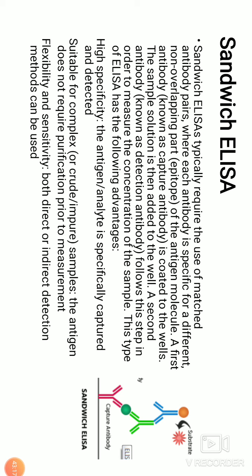Now, sandwich ELISA: antigen can be detected or measured by sandwich ELISA. In this technique, unlike the previous one where antigen was coated, here the antibodies are immobilized on microtiter wells. A sample containing an unknown amount of antigen is allowed to react with the immobilized antibody. After that, the wells are washed.